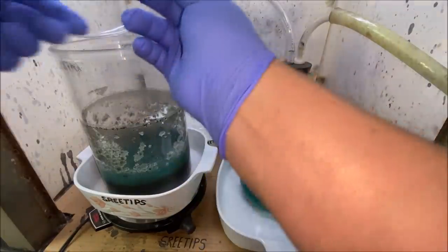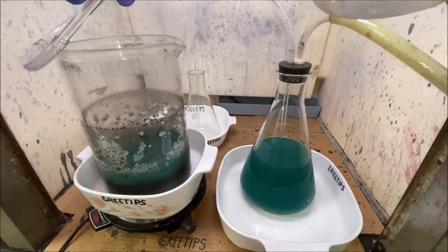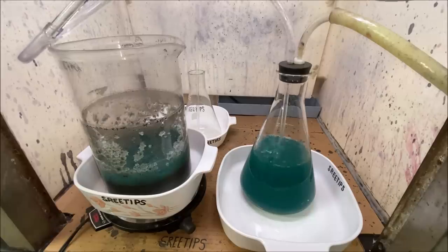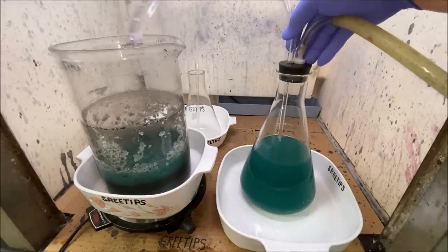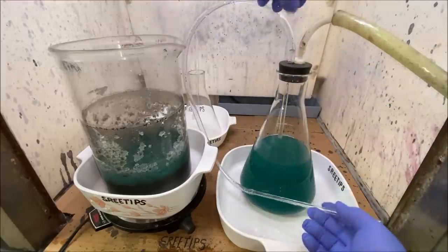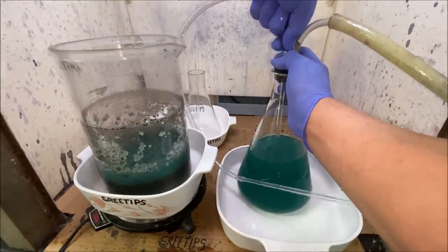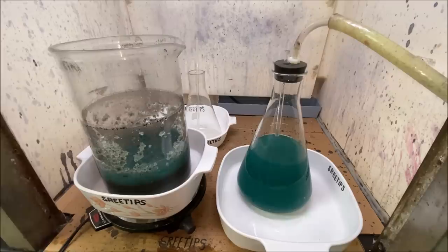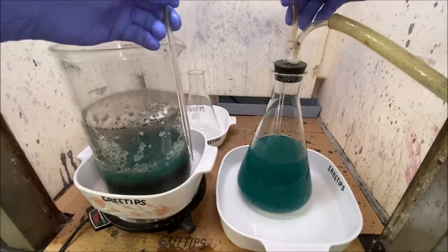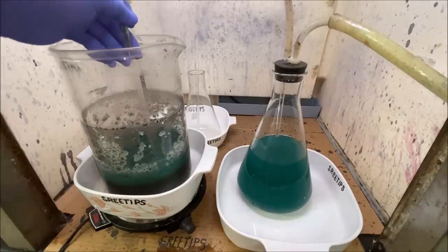As you can see in here in our beaker, we've got some crystals forming on the inside of the beaker there. So I'm going to trade out our suction hose here. This is like a coarse hose. And we're going to put in a tapered piece here and try to draw off the rest of our solution down here.